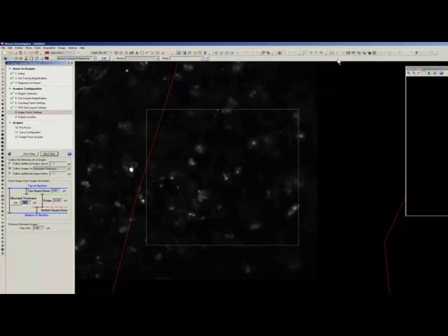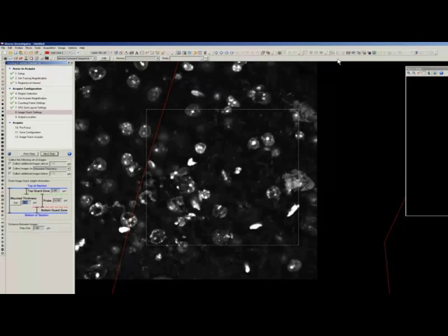Yep, and anybody who's done stereology before knows that what you cut the section at and what it shrinks to by the time you're done with your histological processing are rarely the same.